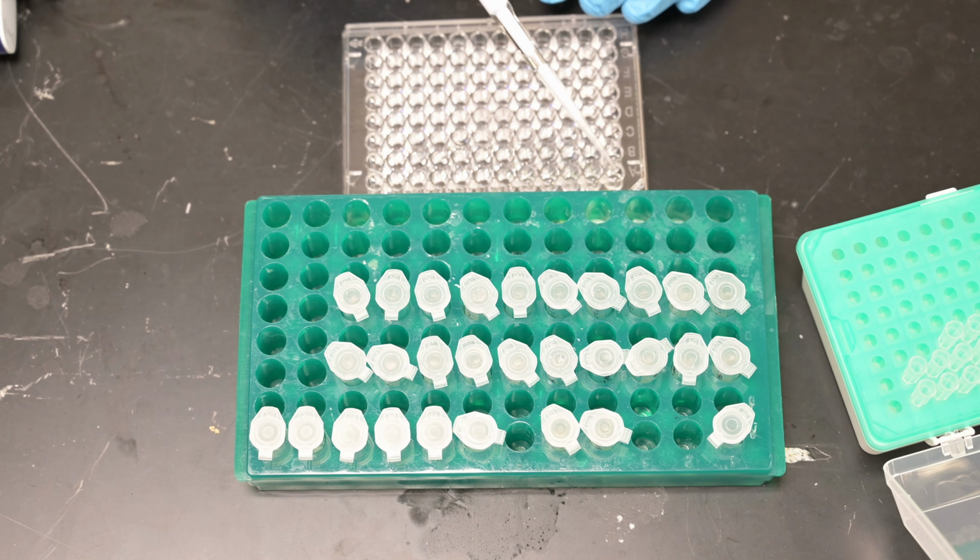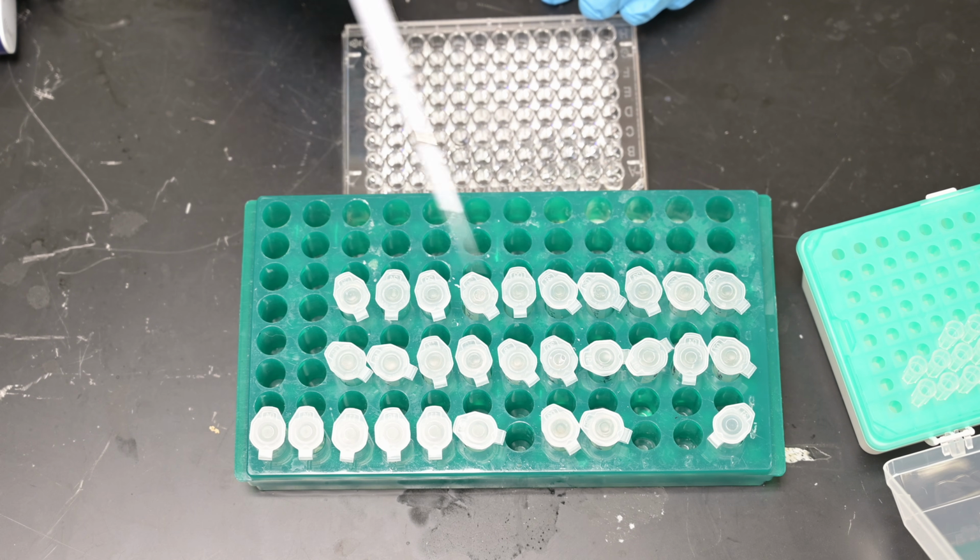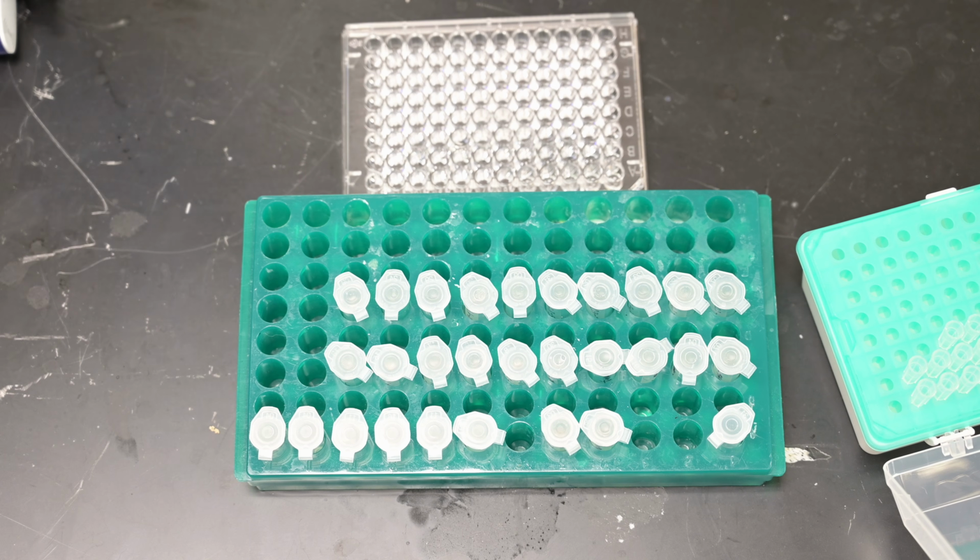So on this plate we have the lysate, lysate 2-fold diluted, 4-fold diluted. Then we have load 1, load 2, and then wash 1, 2, 3, 4, 5. Then the 0.1 molar elution, 0.1, 0.2, 0.3, 0.4, 0.5. Then the 0.3 molar elution, tubes 1 through 5. And then the 0.6 molar washes go into C6, C7, C8, C9, and C10. Next we will do the protein standard.